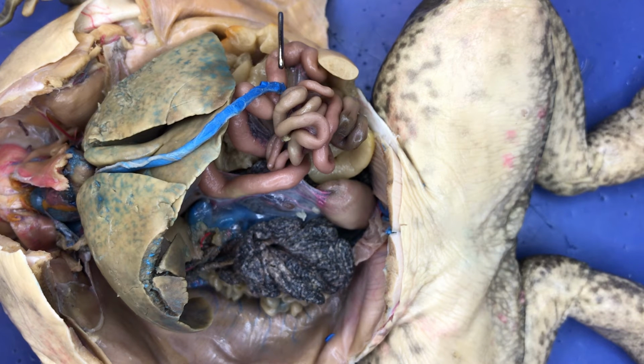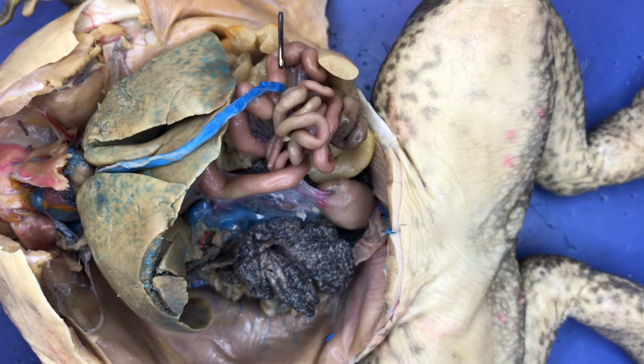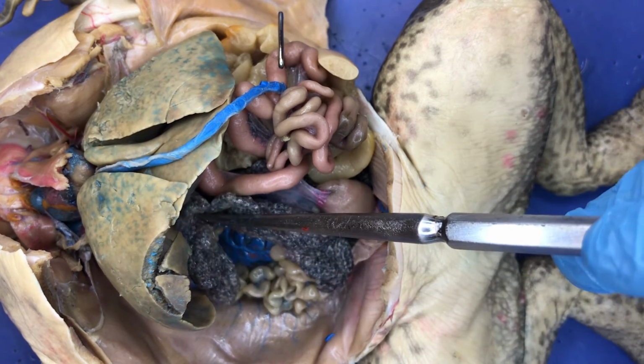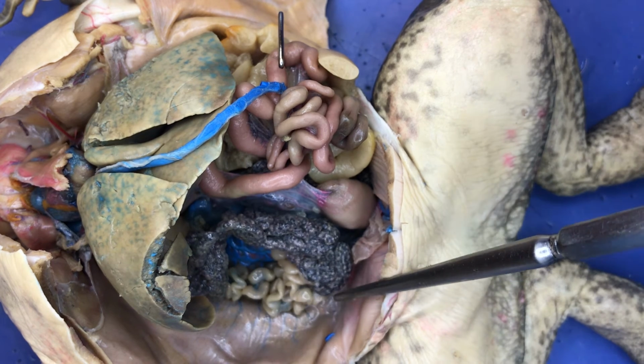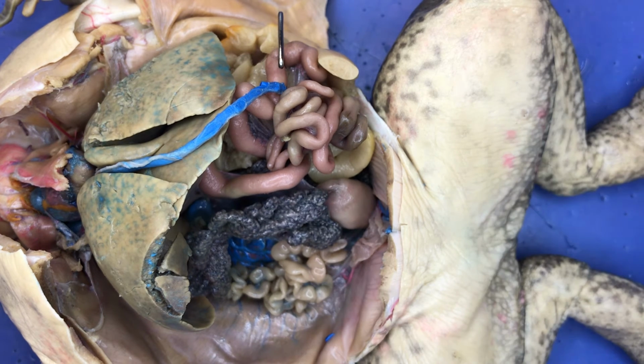Here we can see the reproductive system of the female frog. Eggs are produced in the paired ovaries. Here we can see the right ovary. Eggs then are released from the ovary and enter into the oviduct. Eggs are passed through the oviduct and transported to the cloaca, where they are released through the vent.